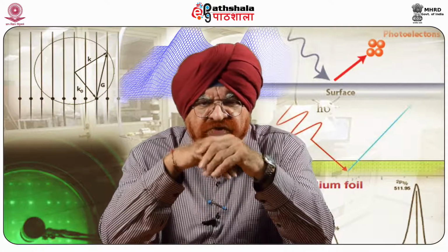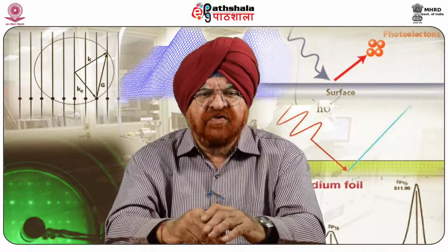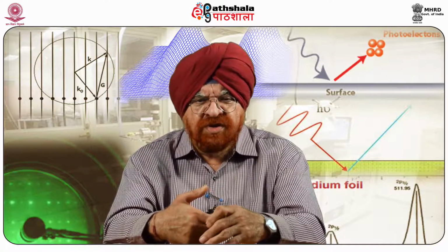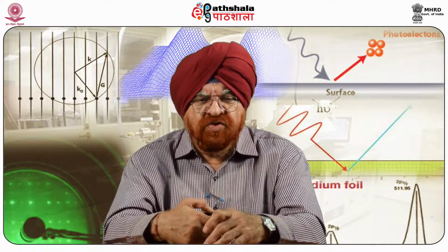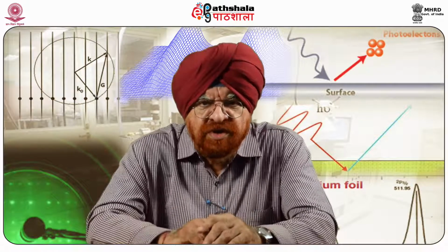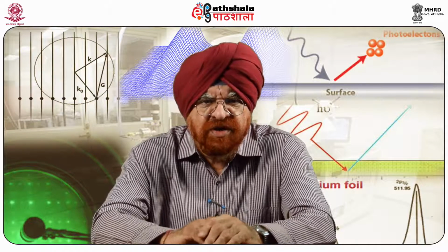Nowadays, the main developments in MFM are focused on the quantitative analysis of data, improvement of resolution, and the application of external field during measurements. This was done by Schwarz and Wiesendanger 2008. The interpretation of images acquired by MFM requires knowledge about the specific near-field magnetostatic interactions between probe and the sample. Therefore, this subject will be briefly discussed hereafter.